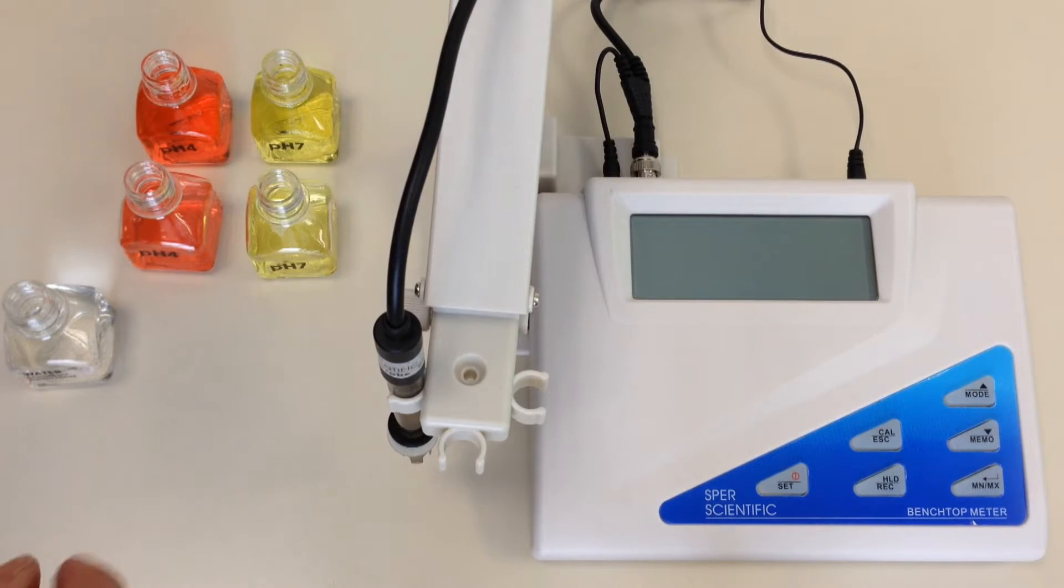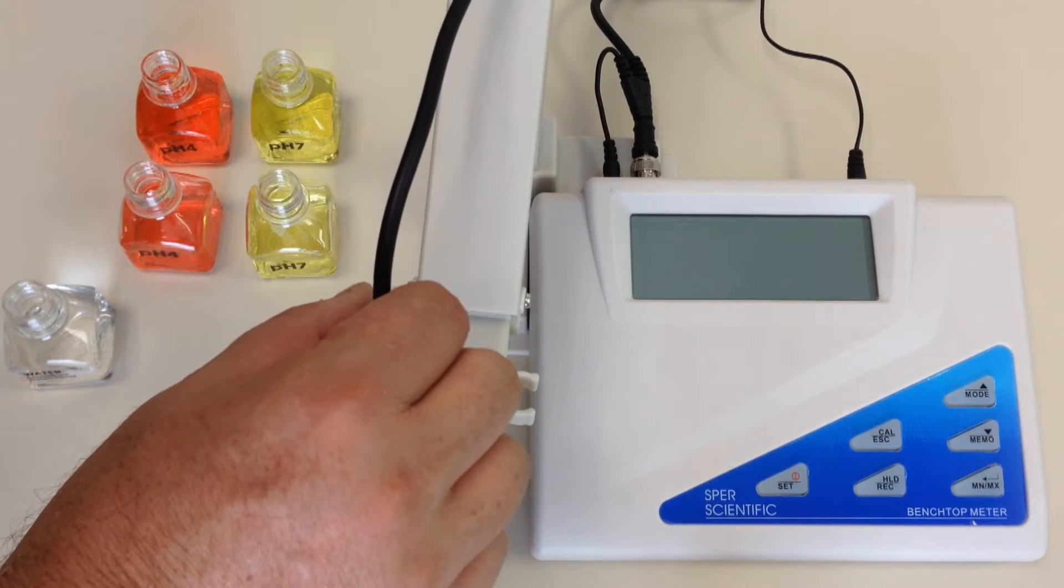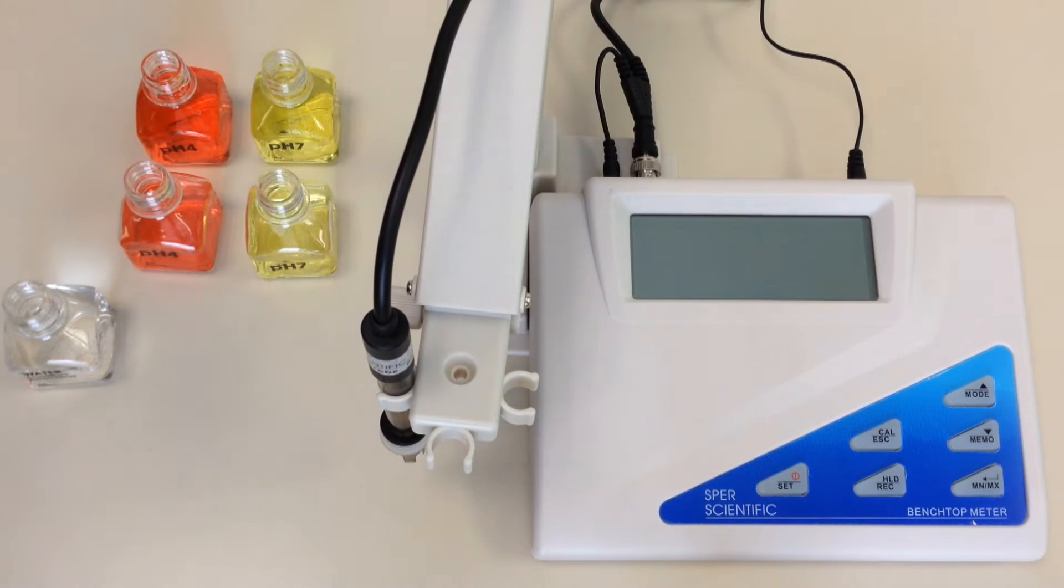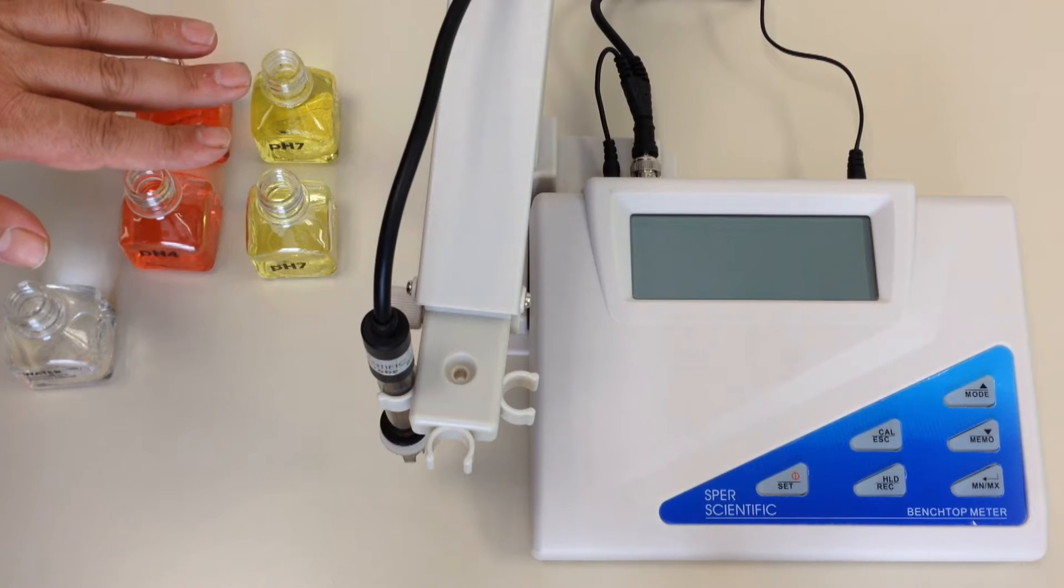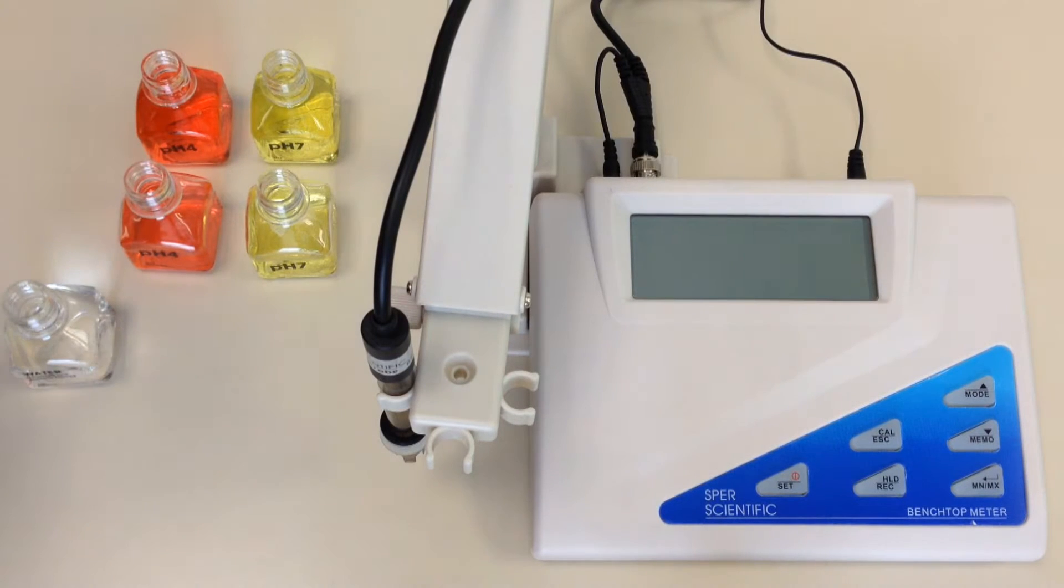First of all, I want to point out that we are using a probe that comes with this particular benchtop that handles what's called ATC or automatic temperature compensation. If you are not using a probe that does automatic temperature compensation, please follow the instructions in the manual. We are also using standard buffer solutions, and if you are using NIST buffer solutions, please pay note to how we change the different features on this benchtop meter.